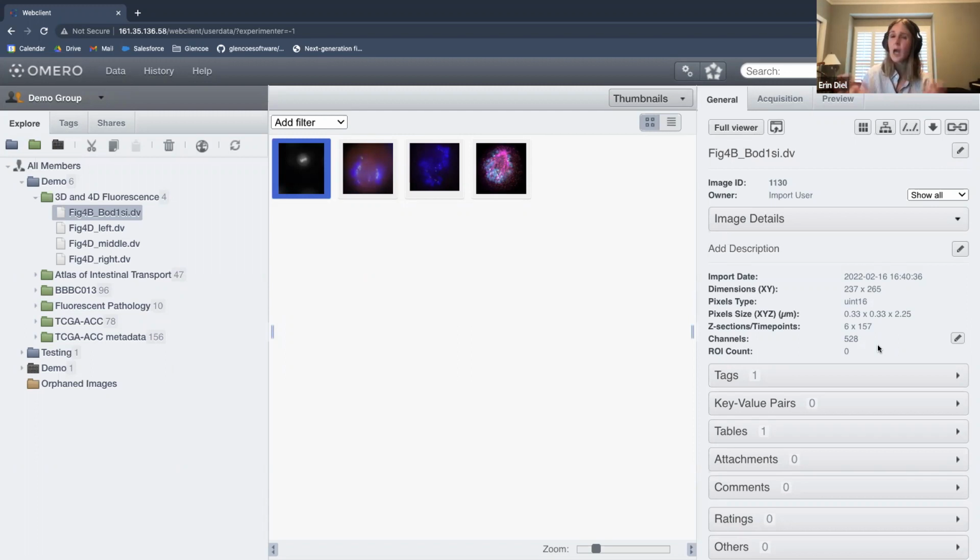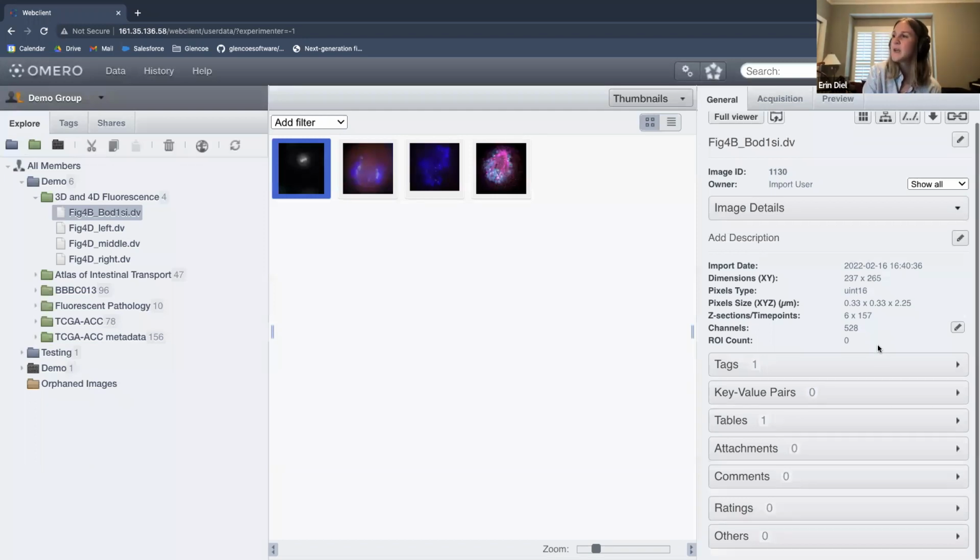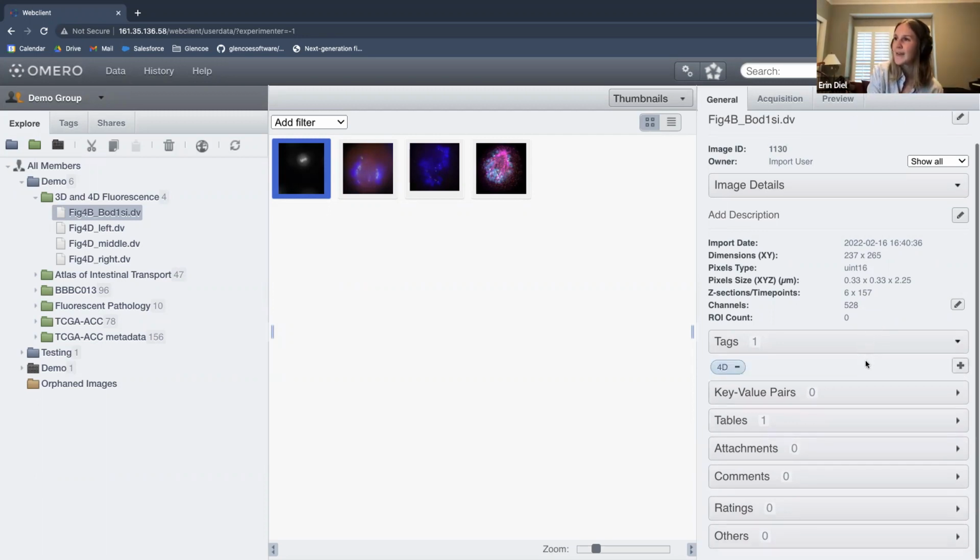As I'm going through this, by the way, this is one example of an annotation, which I mentioned earlier. I was talking about a read-annotate group where you could read someone else's data and also annotate it. Some of the things I'll describe here fall under the category of annotations. There are two kinds of metadata I want to highlight to start with that are relevant for putting experimental or biologically relevant metadata into OMERO, and these are tags and key value pairs.